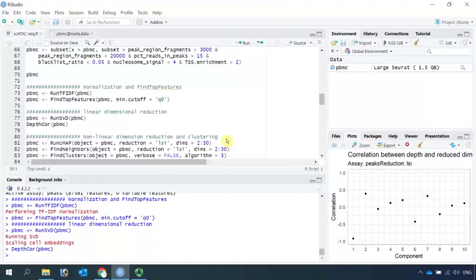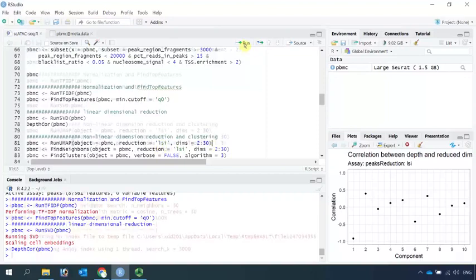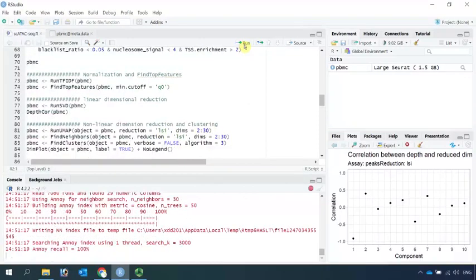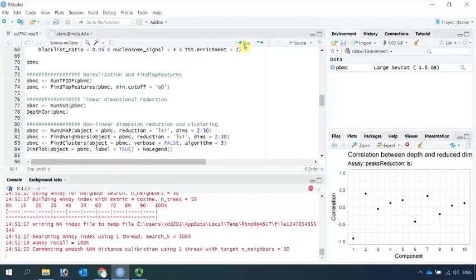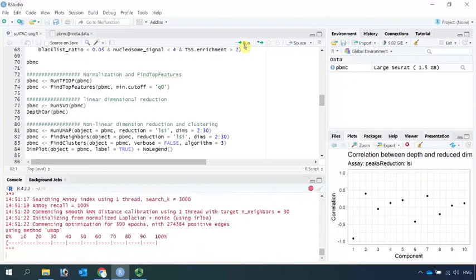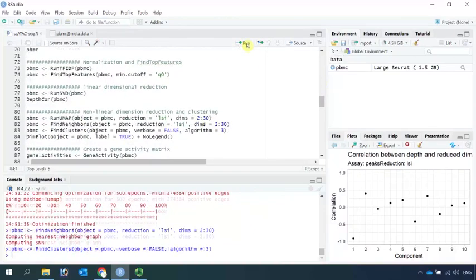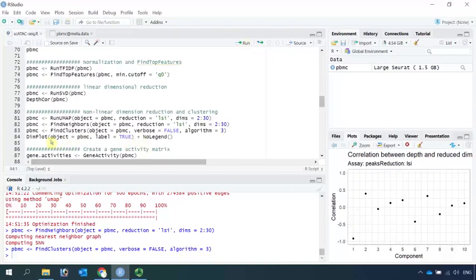First, we run UMAP and remove the first LSI component. Next, we find the neighbors and find the cell clusters. Now we are ready to see the cell clusters. Use the DimPlot function.